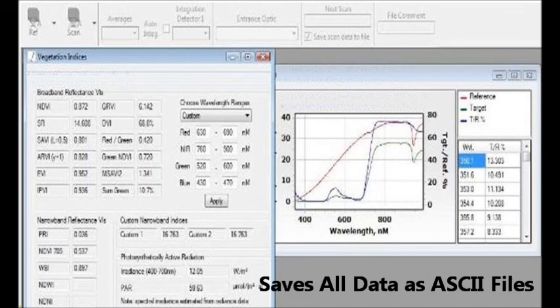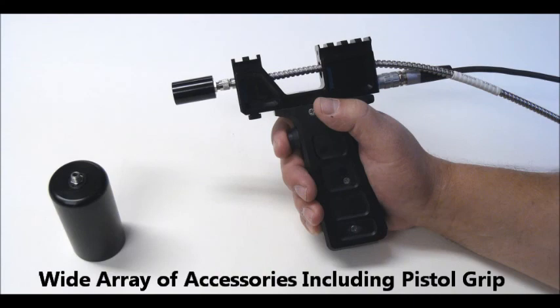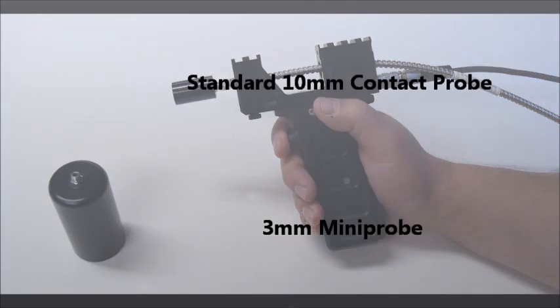All your data is saved in ASCII files for use with other software. The PSR 1100F is available with a wide range of accessories, including a pistol grip with 1, 2, 3, 4, 5, 8, and 10-degree FOV lenses and an industry-standard FC connector.